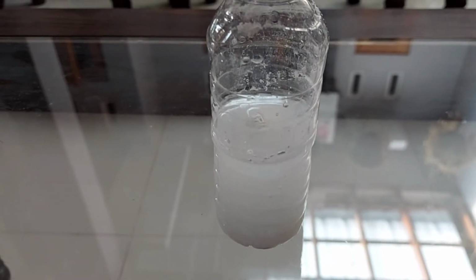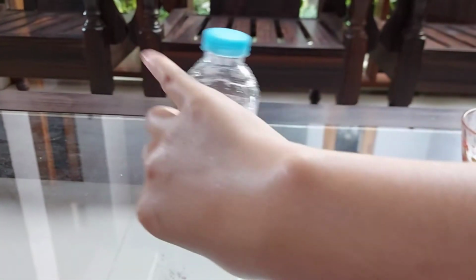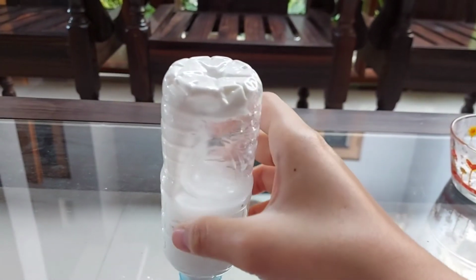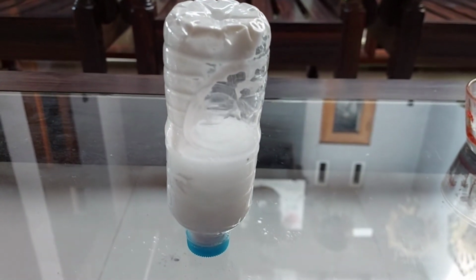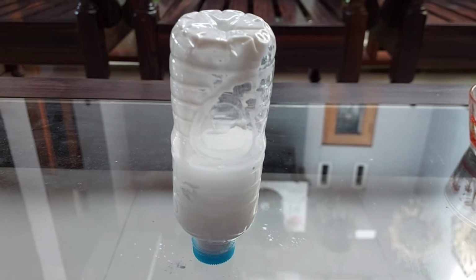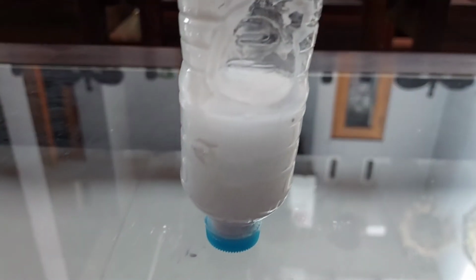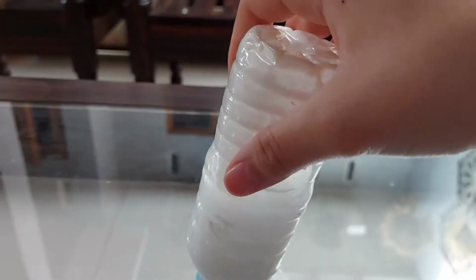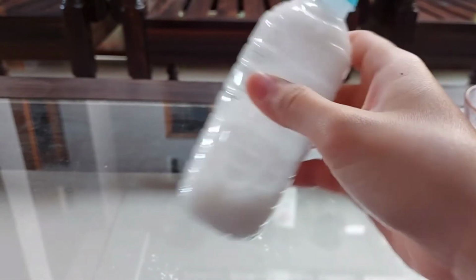After that, turn the bottle over so that the sediment at the bottom of the bottle can drain. If the sediment doesn't drain completely, shake the bottle until it's mixed.